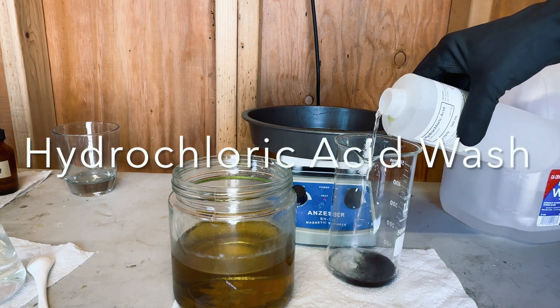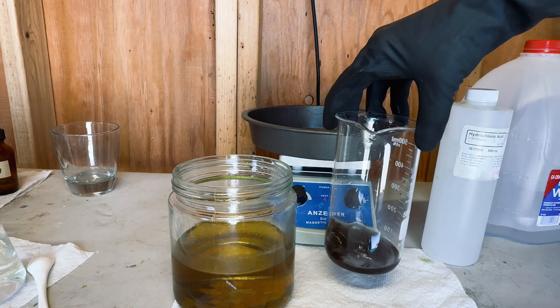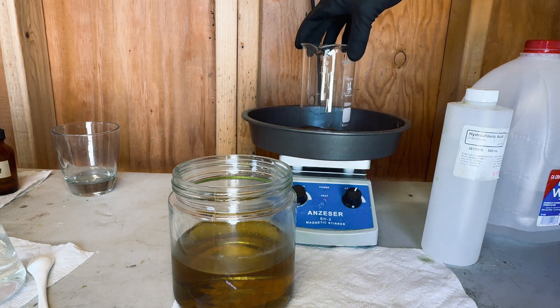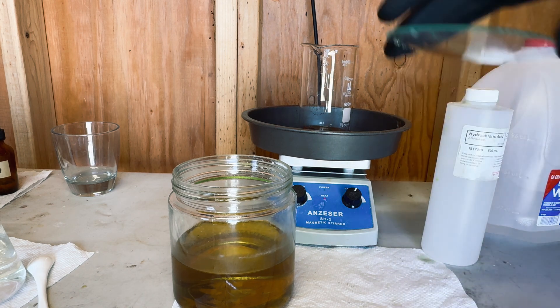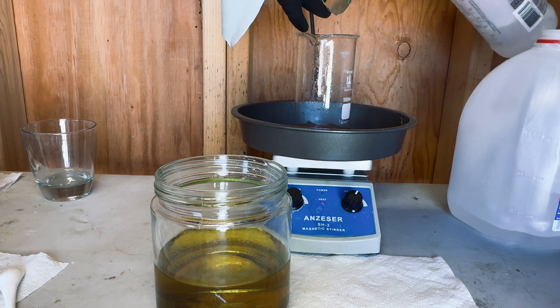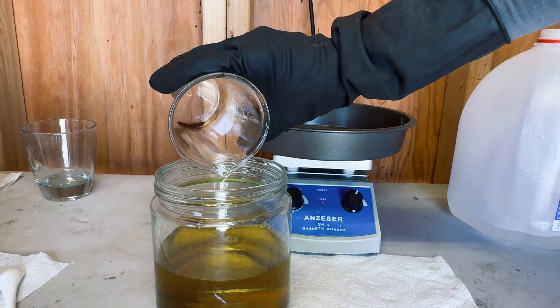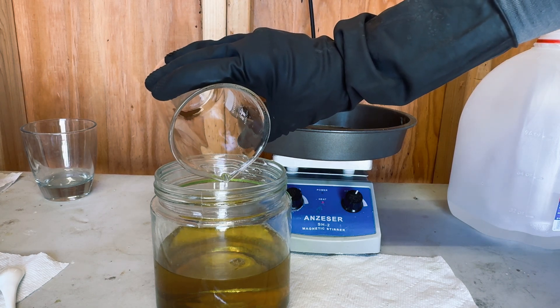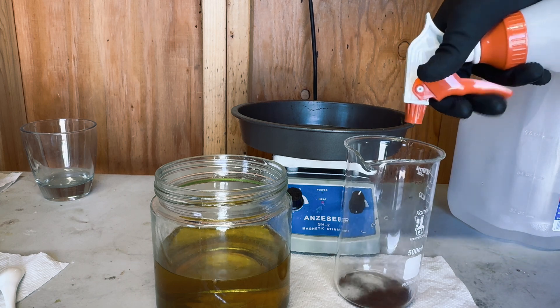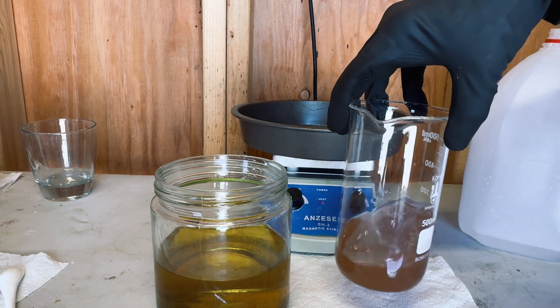We are going to give this one good rinse with distilled water. We will give our material one last wash with hydrochloric acid, and this will be our last distilled water rinse.